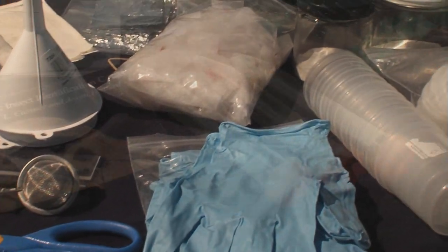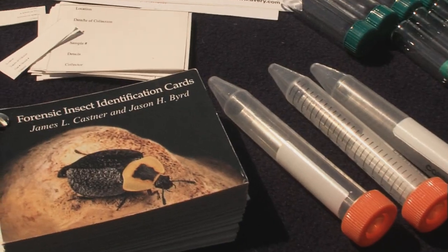A forensic entomology kit is quite extensive, but if you can't get a forensic entomologist to come to your crime scene, it's actually not that difficult to put a kit together yourself.